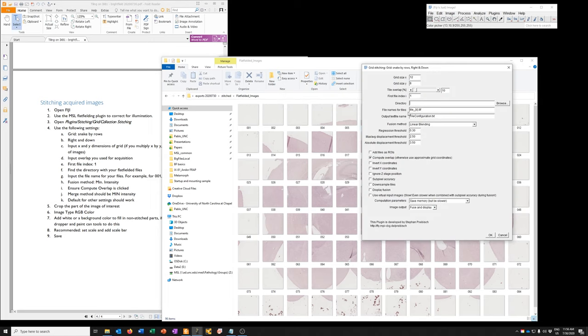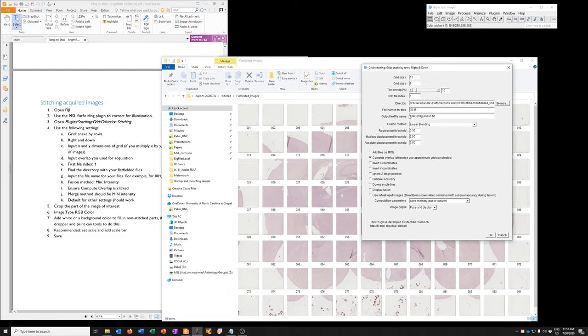The file names for the tiles. So the file names are 001, 002, 003. The syntax of that in this plug-in is to just put in three lowercase i's in brackets .tiff. It'll understand that it's three numbers that increment.